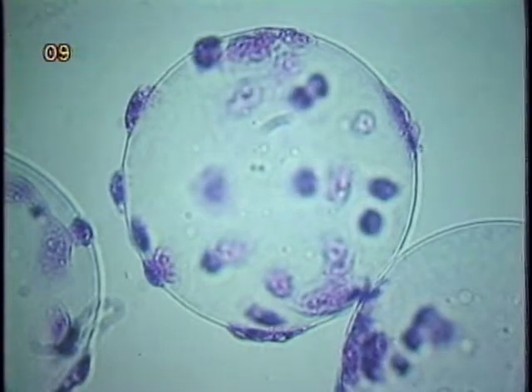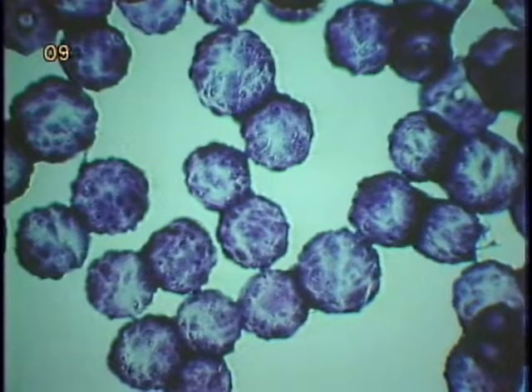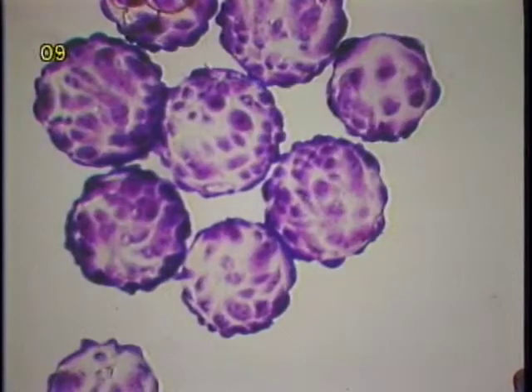Cell growth on microcarriers often results in patches after 1 or 2 days. Given sufficient medium change, cells can grow to a very high concentration. The monolayer density, in terms of number of cells per unit surface area, is about 3 times that of FS4 cells. They can even form multilayers on microcarriers. Chinese hamster ovary cells also form multilayers on microcarriers.